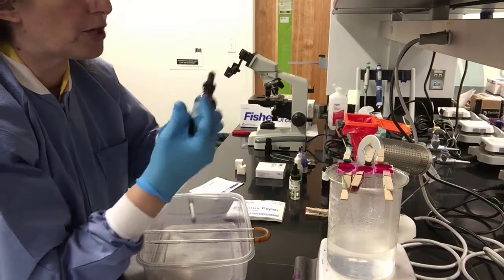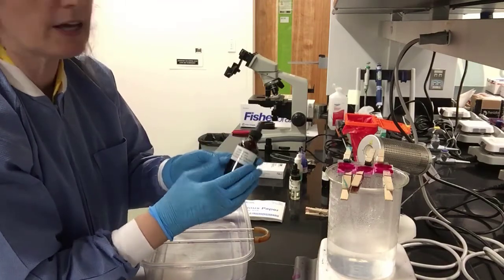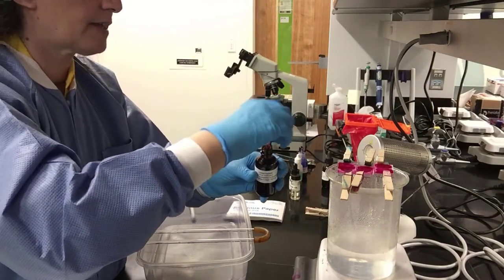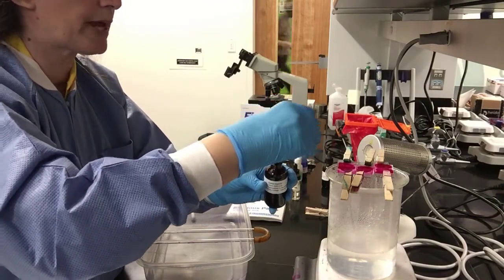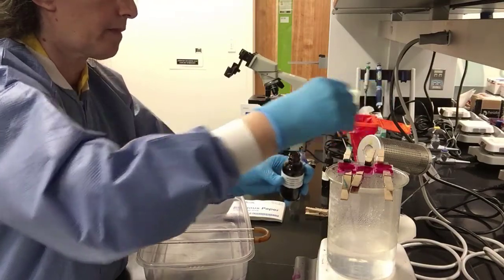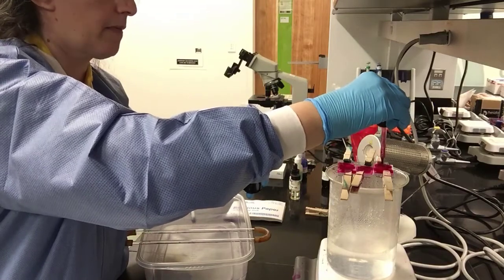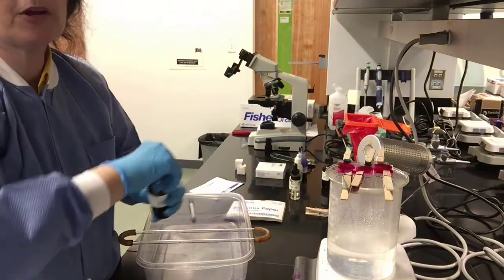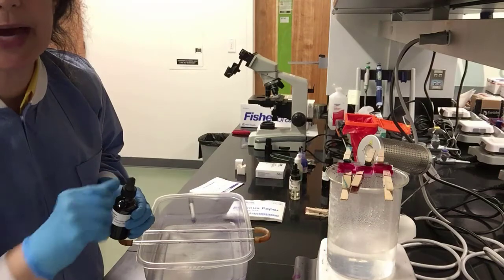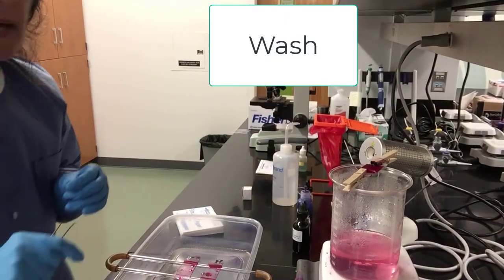After 5 minutes, we are ready to continue our staining procedure. The carbolfuchsin has kind of evaporated, so I don't want my specimens to dry up. So I'm going to flood them again. Lots of good carbolfuchsin here. Okay. And now we have to do this for 5 minutes. Keep watching them. 5 minutes is over.